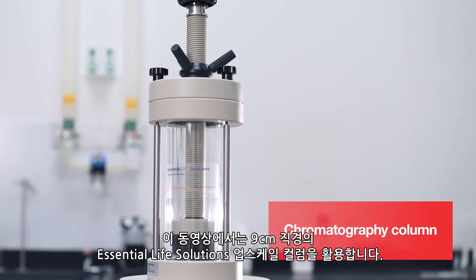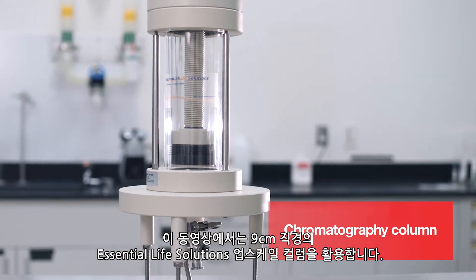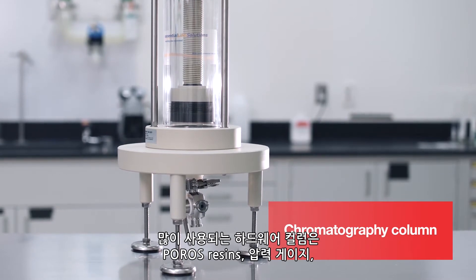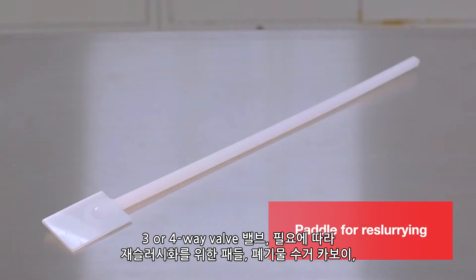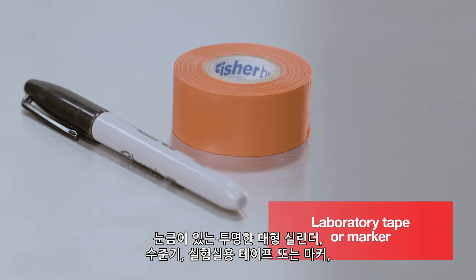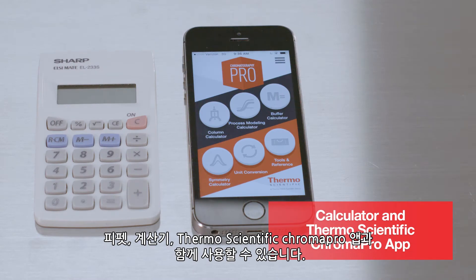In this video we will be utilizing a 9 centimeter diameter Essential Life Solutions Upscale column. Any commonly used column hardware may be used with Poros resins. Additional items needed: pressure gauge, three or four-way valve, paddle for re-slurrying if needed, waste collection carboy, large transparent graduated cylinder, level, laboratory tape or marker, paper, pipette, calculator, and the Thermo Scientific Chroma Pro app.